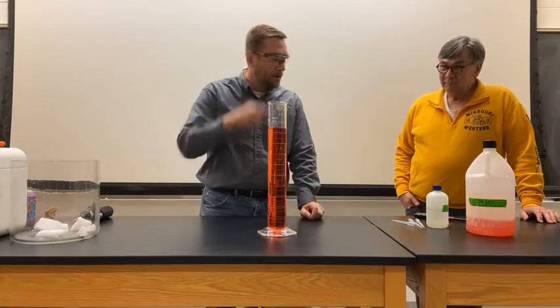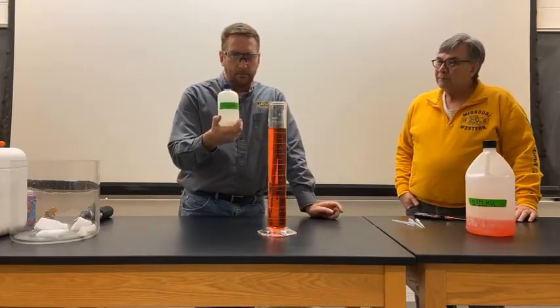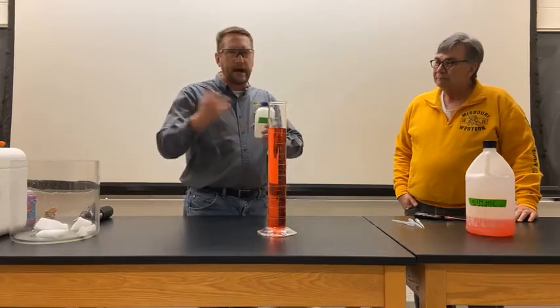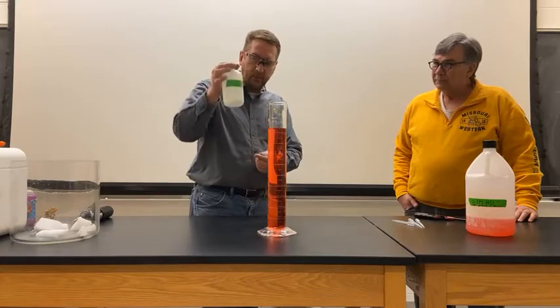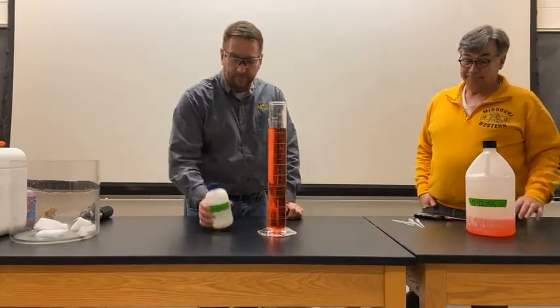That's important to know. So what we're going to do is I've got a saturated solution of sodium carbonate right here. Sodium carbonate is related to carbon dioxide through some equilibrium processes. And sodium carbonate, by the way, is basic. The hydrochloric acid, of course, is acidic.